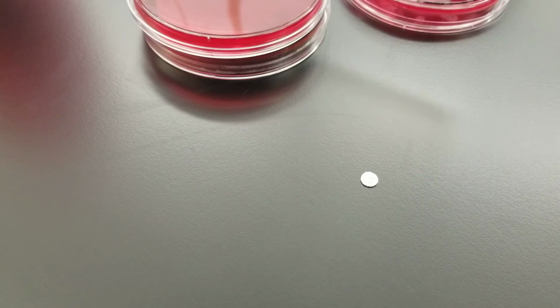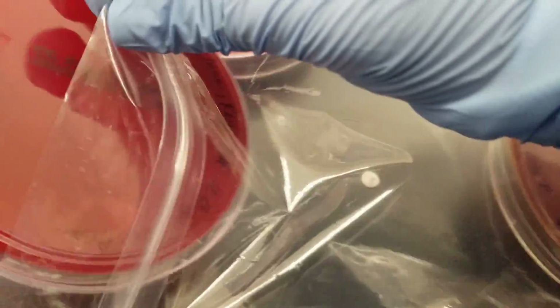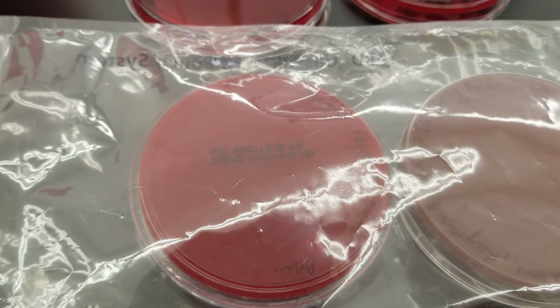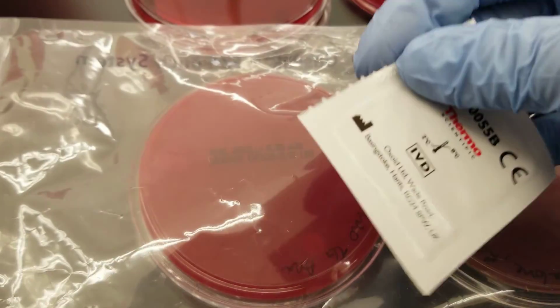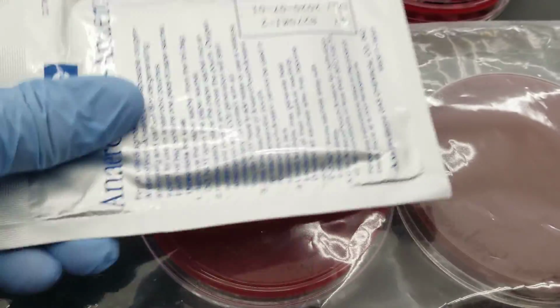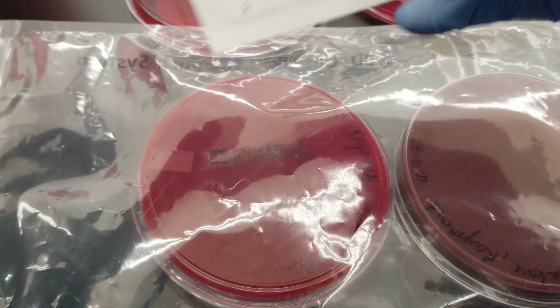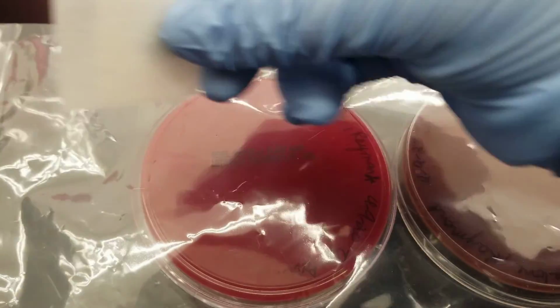I'm gonna put the chocolate down in the front, okay? And then the Brucella. Again, this is a fake person. So we have the indicator that we brought to room temperature, and we also have the gas pack. Let's flip it to English. Okay, anaerobic pouch. All right, so we're going to open this up, put it in there.